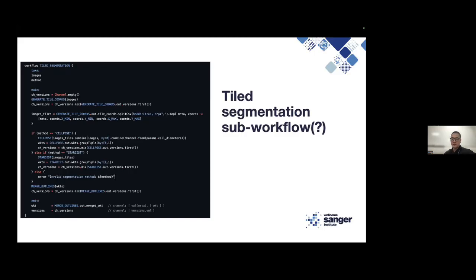You can support Mesmer in the future, and for spatial transcriptomics, we can also use Sager, but we will need a little bit more information in addition to images. We will need transcript locations for that as well. But anyway, the idea is the same. This can be really scalable and can be extended to different technologies.